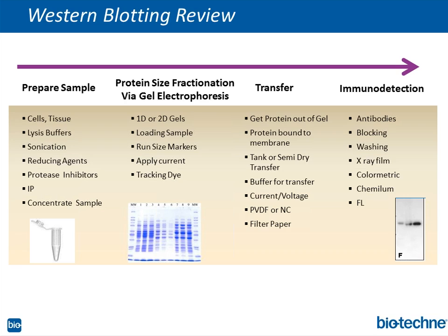Now, fluorescence is not as popular, and part of the reason is you need some capital equipment, of course. Sometimes the membranes will autofluoresce, but multiplexing is possible with fluorescence, and it's something a lot of people are thinking about because you can probe multiple targets on the same blot using different colors, and that's the beauty of it. It's also more sensitive, of course.